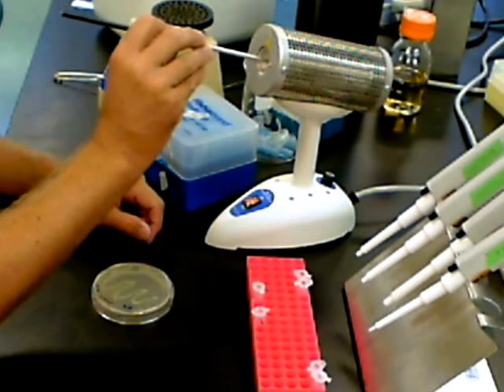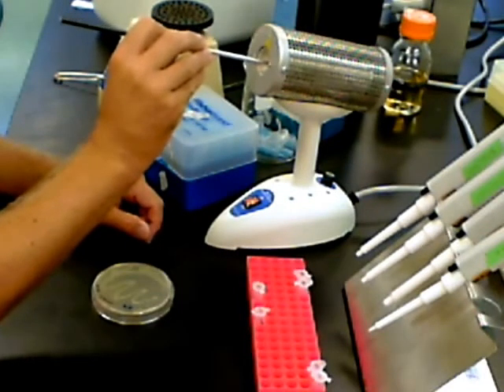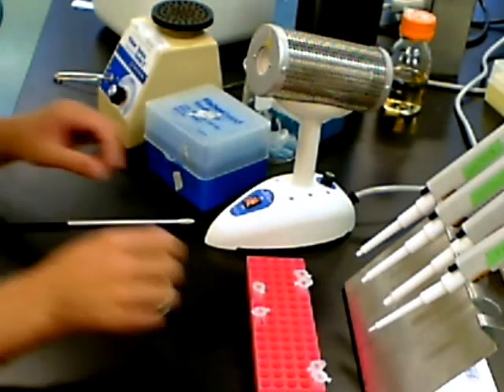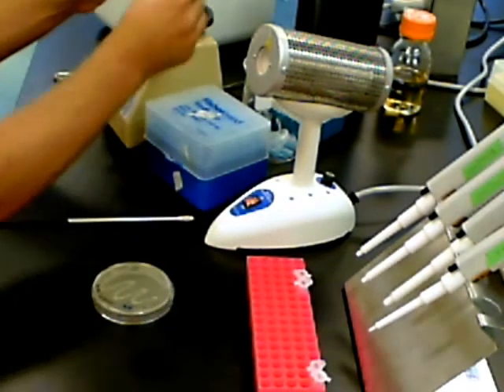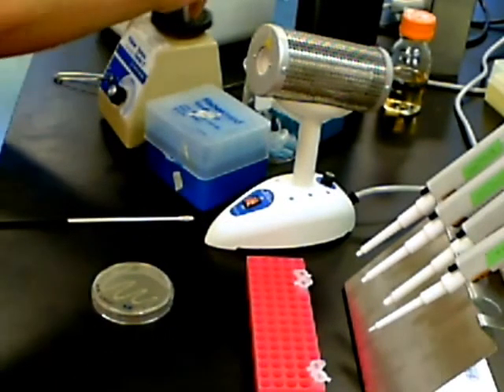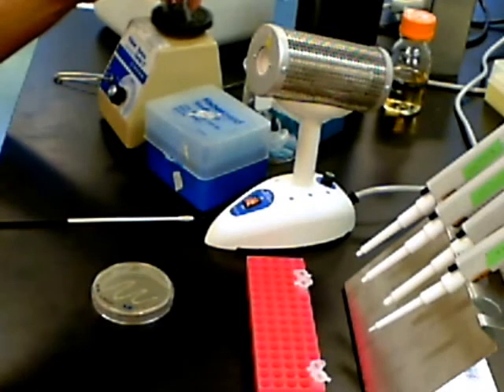After you've added the cells to the Eppendorf tubes, cap them pretty good and stick them on the vortex machine so that the cells can be completely suspended in the calcium chloride.